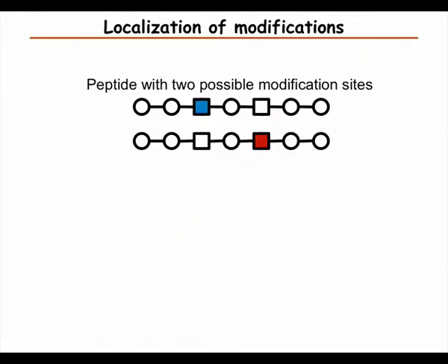So then the question is, can we start thinking about a statistical framework for how to assign a confidence in assignments of phosphorylation sites? We talked about how we can calculate different measures for how well we trust identifications.